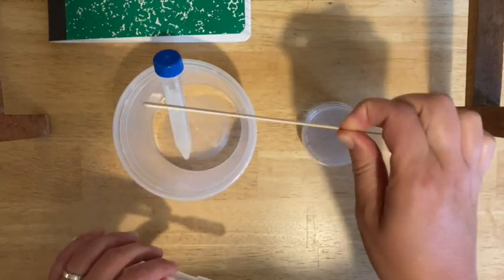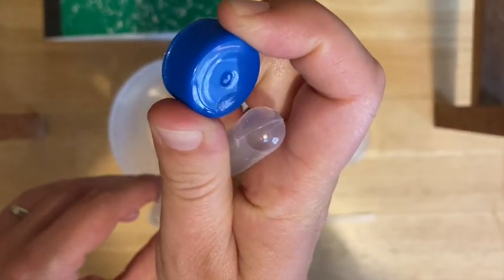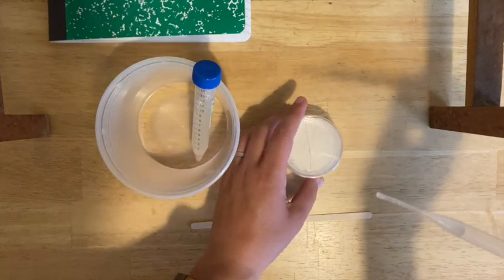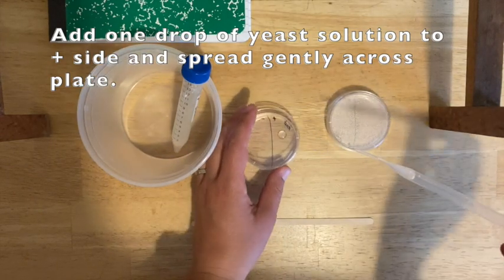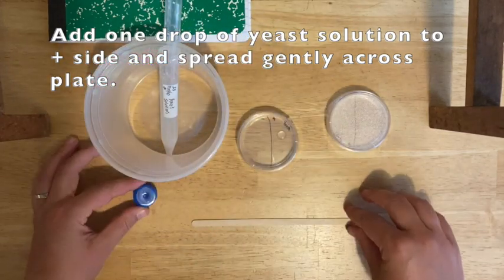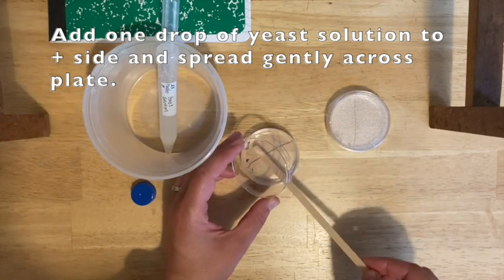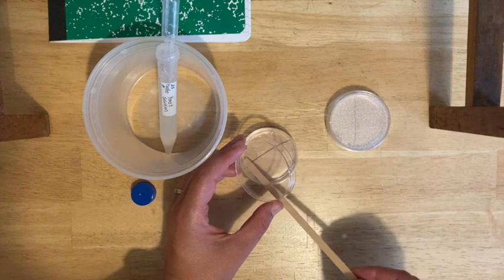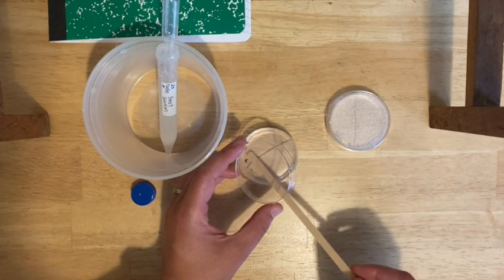You'll need a clean wooden stir stick and a clean transfer pipette. Put one drop onto the plus side of each plate. Take your wooden stir stick, carefully open the plate and hold the cover over it so nothing falls from above. Gently spread the liquid across the surface of the plus side only — don't touch the minus side. Be very gentle, like you're icing a cake. You don't want to dig in or disrupt the agar at all — slide it across the surface on the plus side.